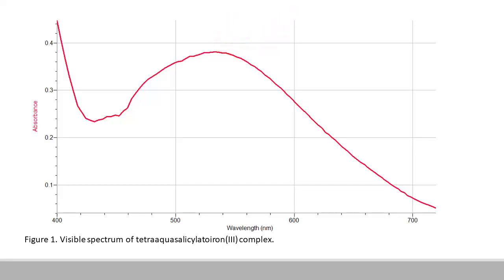Hopefully this video has helped clarify the steps involved in the spectrophotometric analysis of aspirin.